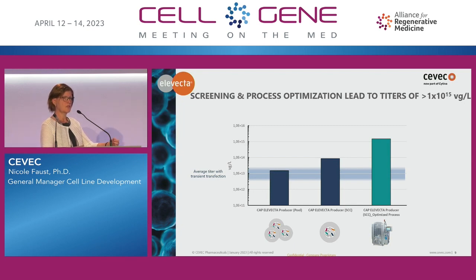that you can very nicely do with a stable cell. That's tricky to do with transient transfection. And here, we gained another order of magnitude. So we ended up with 3 × 10^12 Vg per mL, 30 to 40% full particles in this particular case, and you have a very reproducible process here. Since you're dealing with a stable cell line, you don't have any inconsistencies in transfection efficiency or the material that you're adding.